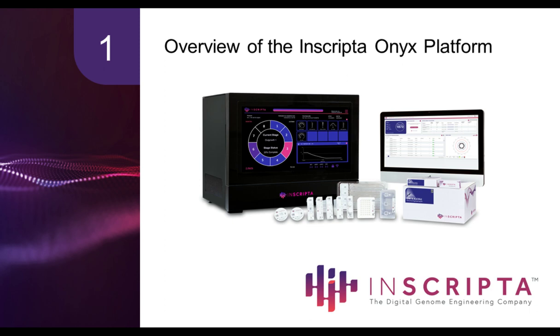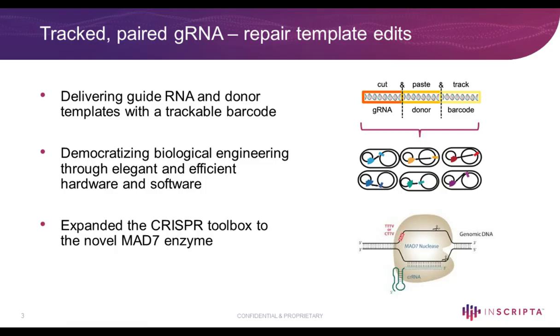To begin with, for the overview of the platform, the fundamental basis of the platform is founded on the concept of co-delivery of a guide RNA, a CRISPR, and a donor template all in one, that then can simultaneously be barcode tracked inside the cell.